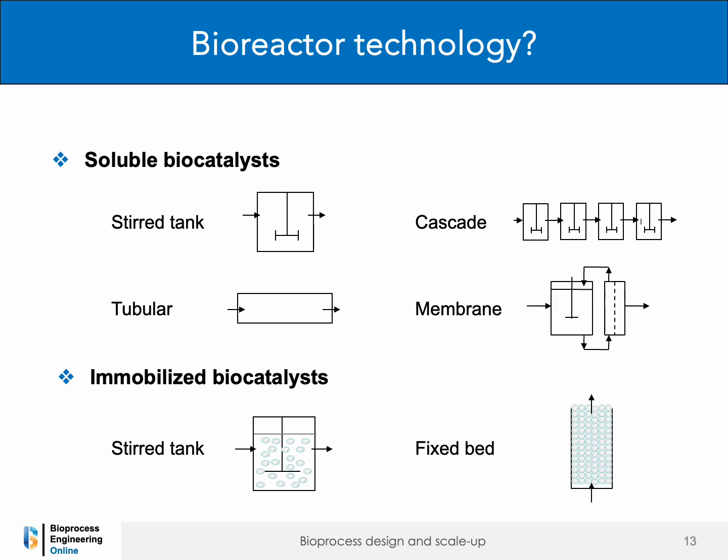Moreover, the bioreactor can be integrated with a microfiltration or ultrafiltration module, functioning in a continuous perfusion mode. In this scenario, substrates are continuously supplied, products are continually removed, and the enzymes or cells are retained within the reactor. All these diverse bioreactor technologies and operation modes find application on an industrial scale.